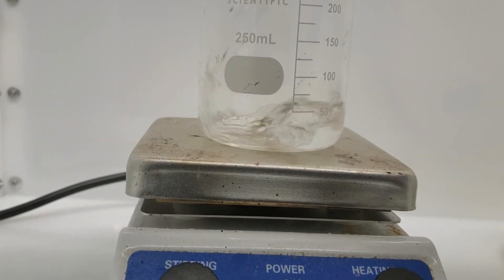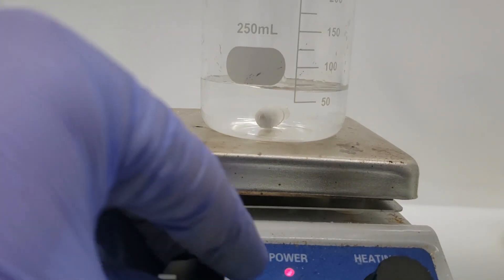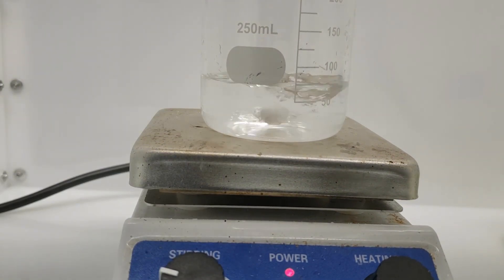A solution of 15 grams of oxalic acid dihydrate in 60 milliliters of water is then prepared, with stirring and heating so that it dissolves.